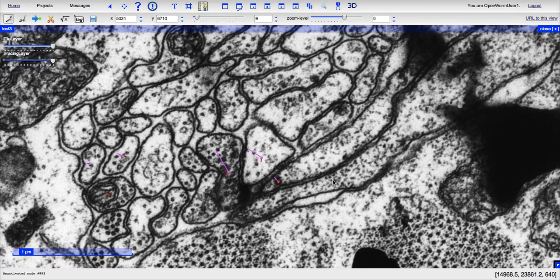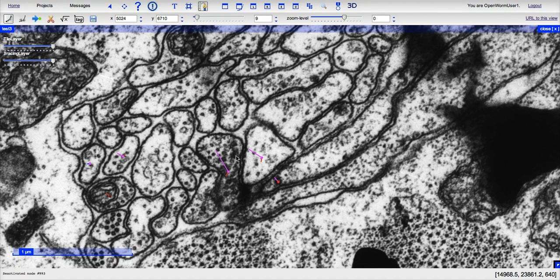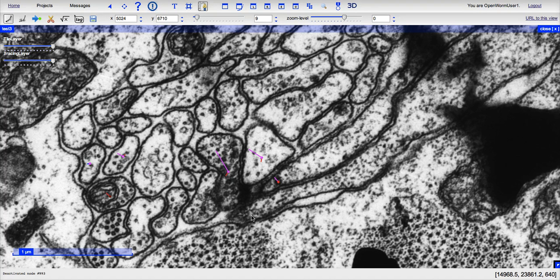In the area where I'm circling with my mouse now, you can see that there's a neuron which appears to have some vesicles, which are electron dense, and also the structure here which appears to be a presynaptic density.